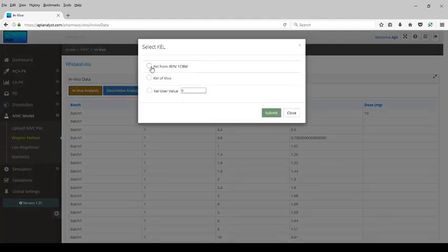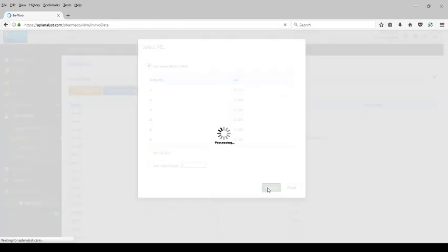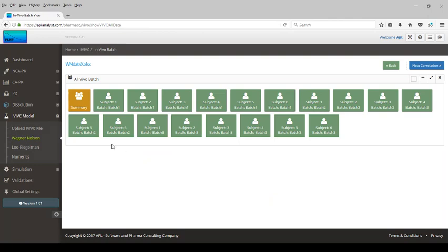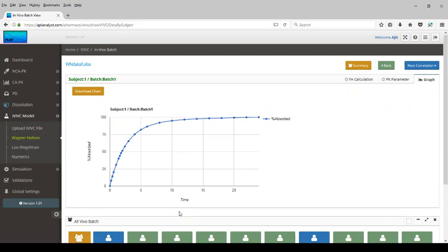Let's perform the in vivo analysis. We will use the KEL value needed for the Wagner-Nelson computation of the fraction absorbed. Here is the Wagner-Nelson method with the previously computed data displayed. We submit this data so that the fraction absorbed computation can be done. The fraction absorbed computation for six subjects across three batches is performed. The computation and graphical analysis of the fraction absorbed for one subject is shown.